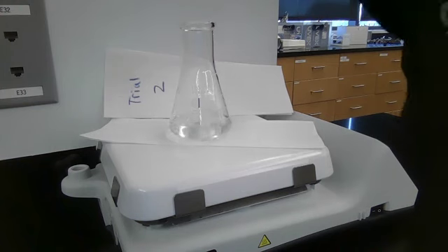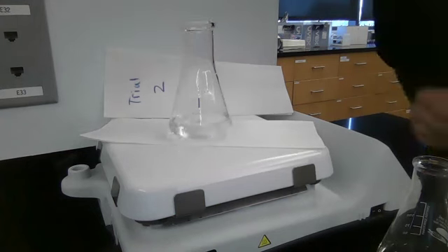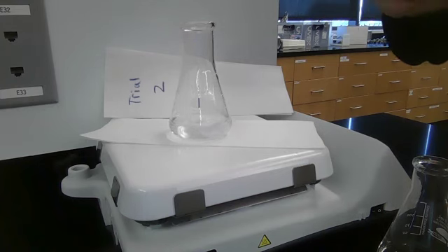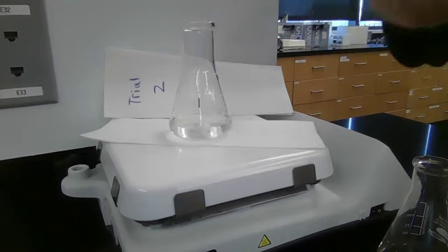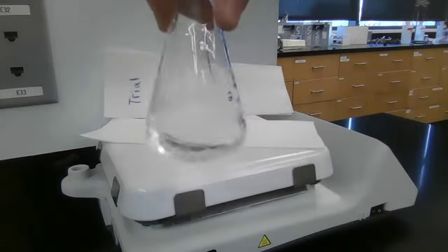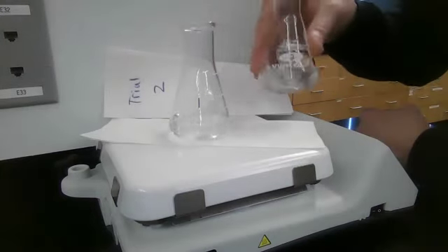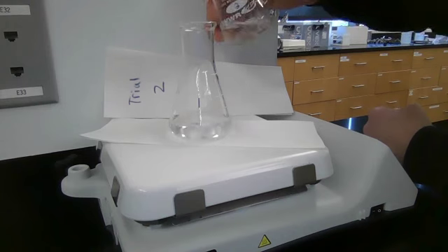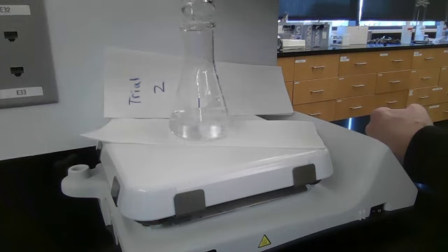All righty, we got flask 2 ready, and I'm going to throw it in. Don't forget to start. All right, that first trial we didn't have as much starch. I'm going to put how about 5 drops? 1, 2, 3, 4, 5, 6, 7. 7 drops. All right. This here is flask 2. Get ready to start recording upon contact and mix. Here we go for trial 2. All right, you can start recording, I believe.